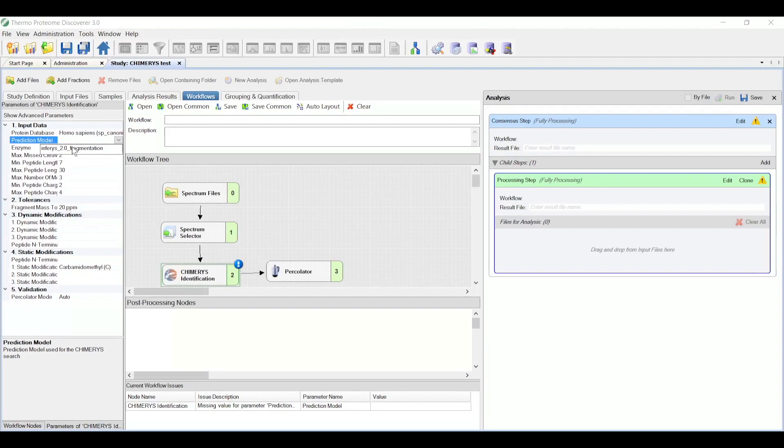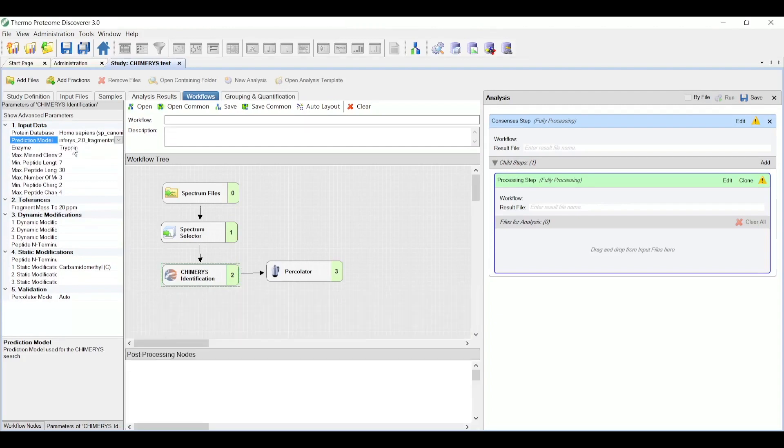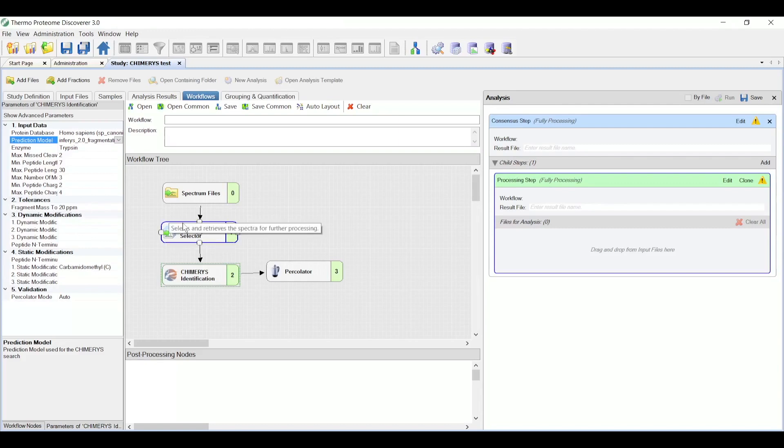And I'm happy with the static modification, alkylation, and 20 ppm tolerance. This is high resolution HCD MSMS.